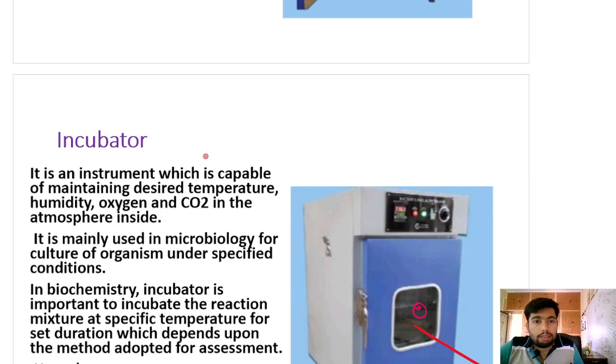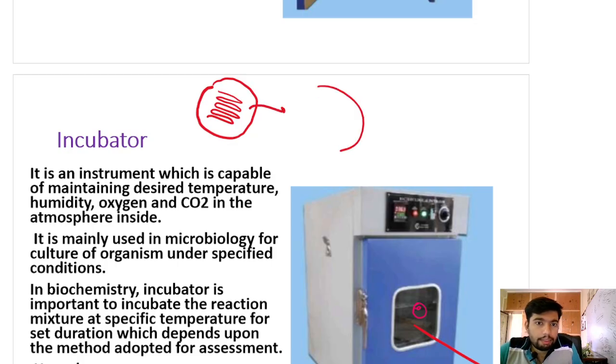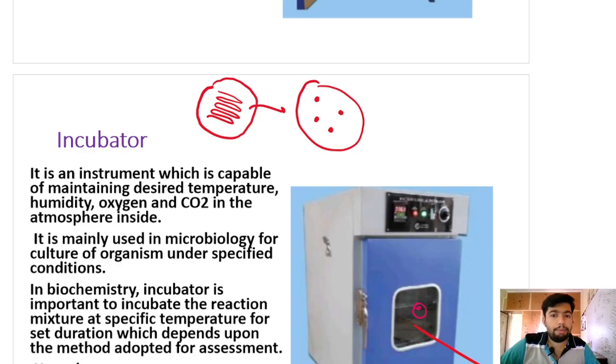incubation. So in your second year, you know this is a culture plate in which I have performed the streaking or lawn culture of that particular organism from the sample. And if I incubate, I can see the colonies of suspected bacteria after incubation. So this is how the microbiological experiments actually happen.